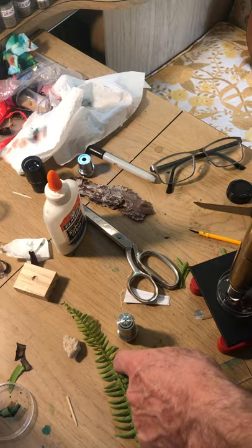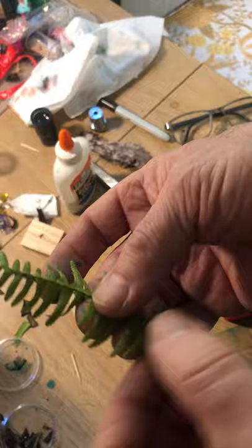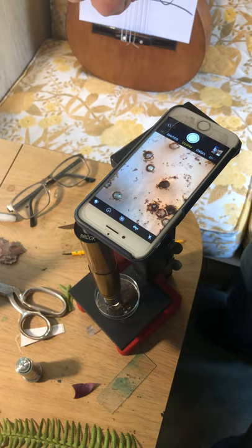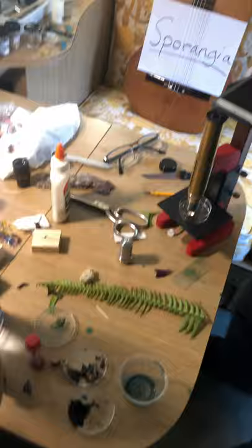But we need to show you that at higher power to really do this justice. To start with, you've got to find some ferns. Look at the back of the leaf — the back of the leaf will tell you. If they're just little bumps and they don't look like they're opening up, they're not ready yet. These things love humidity; they start to develop in humidity and become fertile in humidity. So you scrape them off, and a little food dye works wonders. You can put the food dye on with some inexpensive alcohol — I use cheap vodka, which is the only thing I use it for, diluting stain.